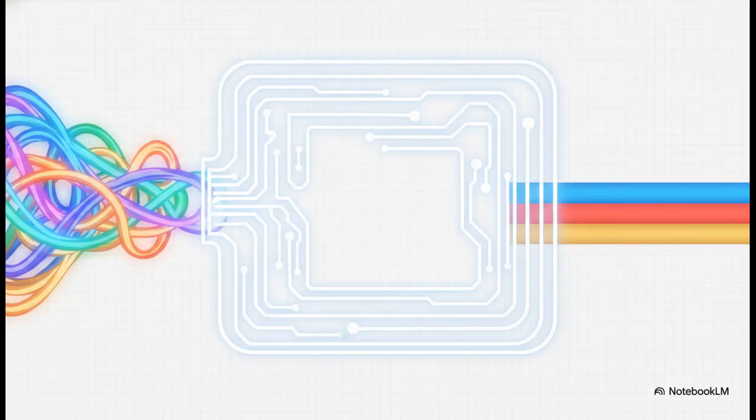The true detective work here is how we arrange these components. By placing elements into logical series and parallel combinations, we create models like the famous simplified Randles circuit. But why do we even care about parallel versus series? Think of it like water flowing through pipes. If current has two paths it can take, which is a parallel circuit, it's going to split between the easy path and the difficult path.